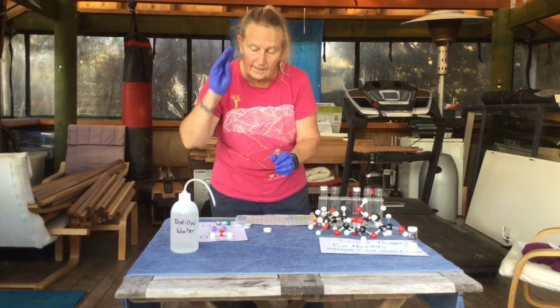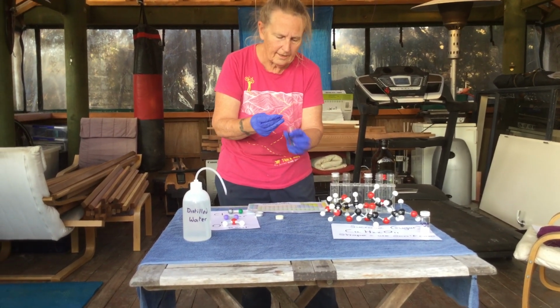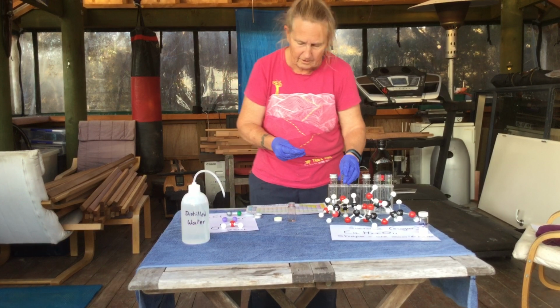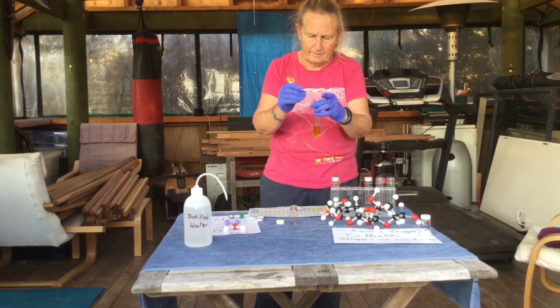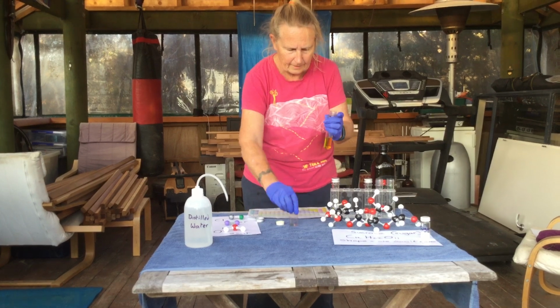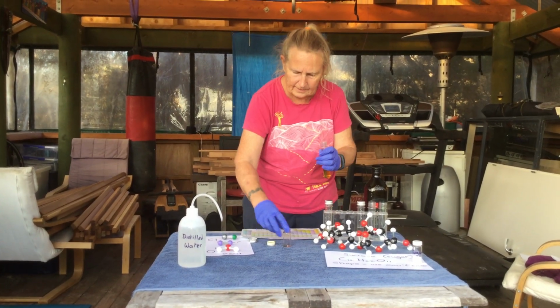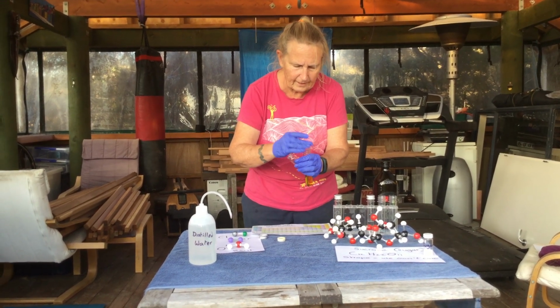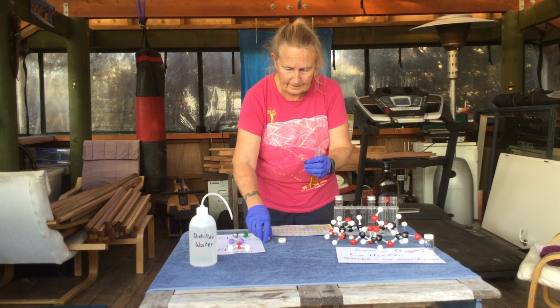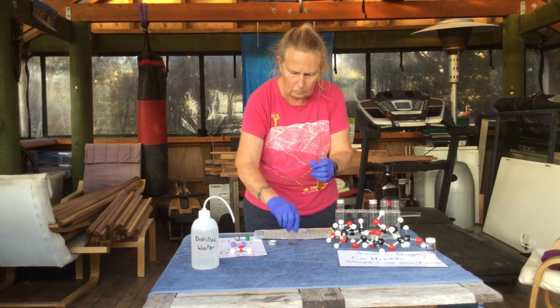I hear some people say, yes, it will be soluble in oil because it is a covalent bond, because the pulling power of each iodine atom will be the same. And so the bond must be covalent. If it's a covalent bond, let's just put a little bit more in. If it's a covalent bond, then yes, it will be soluble in oil and not in water.